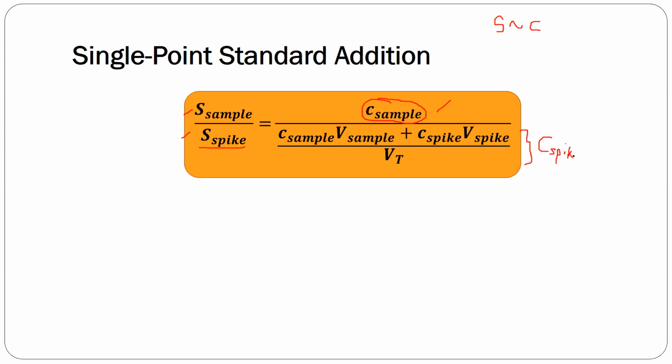So, please understand this, no? You can, yes, memorize the formula, pero paano pag nakalimutan mo yung formula? Kasi medyo, hindi naman sa komplikado, but probably, it's quite a long one for you. Ang gawin mo is, intindihan mo yung ibig sabihin ng formula. So, to get the concentration of the spike, ganito siya. Di ba ito yung sample mo? Concentration. Pag minultiply mo siya ng volume ng sample, anong lalabas? Siya yung amount ng original sample. Let's say ang sample mo milligram per ml, concentration, times the volume which is ml, milligram na lang matitira. So that's for your sample.